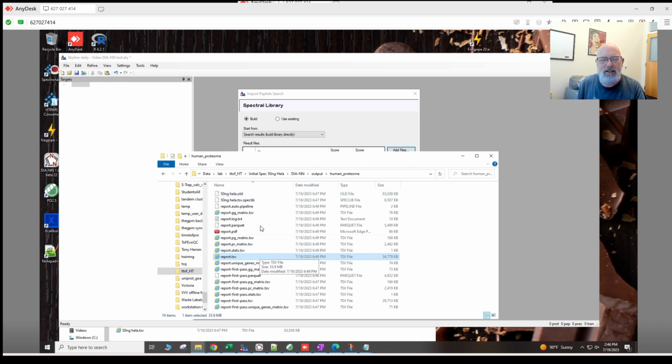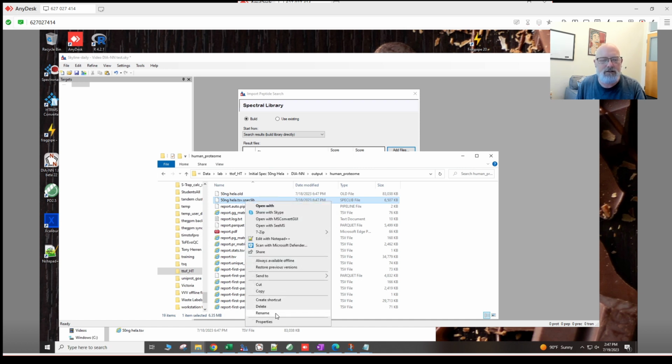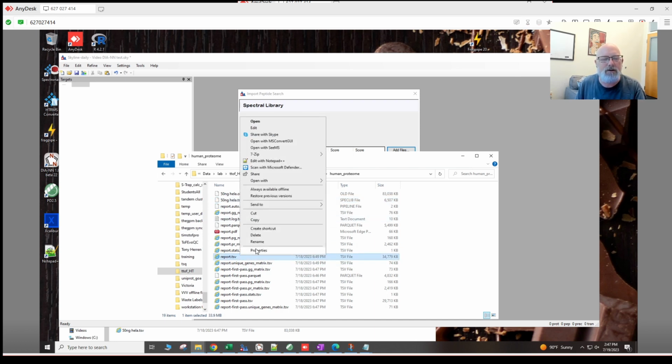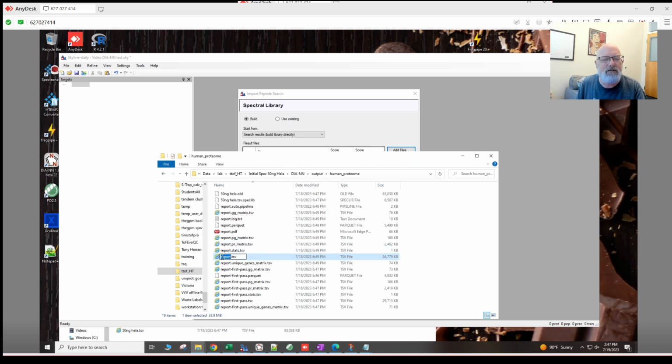This is the report it needs. So what we do is we rename, I'm just going to copy this from this file because it has to match. And we take this report.tsv and we rename it. And we put this on top and like underscore or something, report, boom.